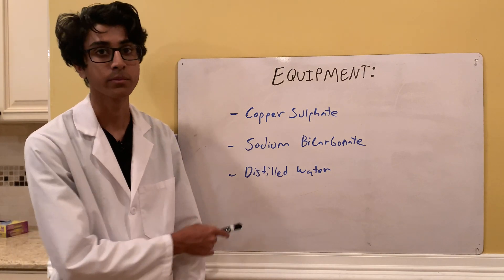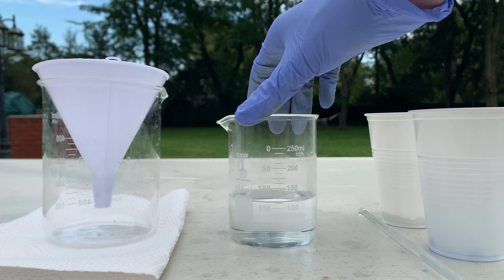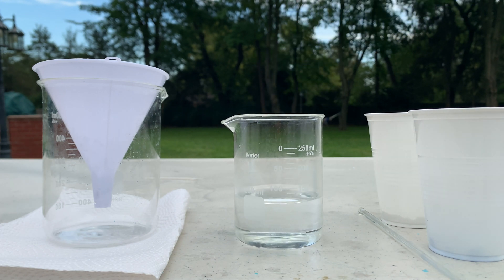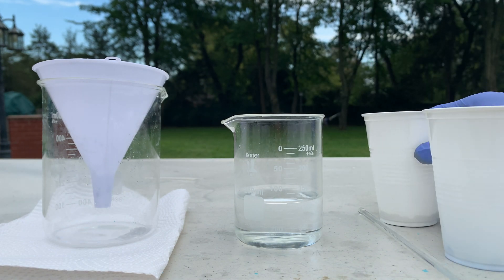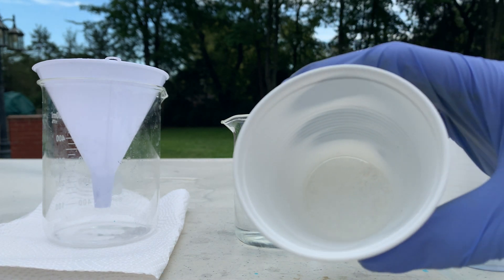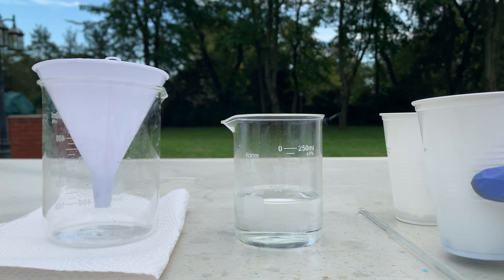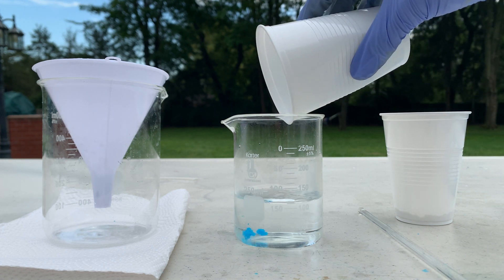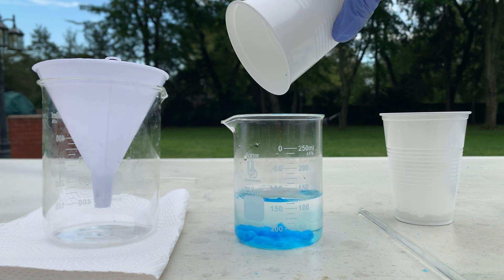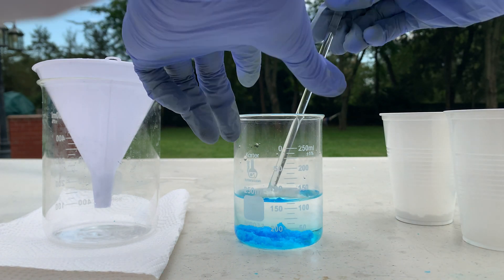I've got about 110 milliliters of distilled water warmed up just a little bit, and I've got around 7 grams of copper sulfate and around 5.9 grams of sodium bicarbonate. I'm going to start by adding the copper sulfate into the distilled water and mix it around so all of it dissolves.